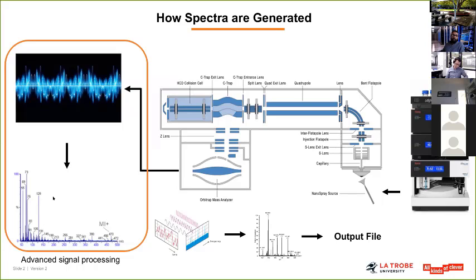And this result, if you're familiar with genomics data, is slightly different to what we get from there, because at the end of the process, what you will get is a bunch of numbers. This instrument will not give you a list of amino acids. In order to get the numbers, we had to do a bit more number crunching here, Fourier transform, and then plot them and store them into a data file, an output file.